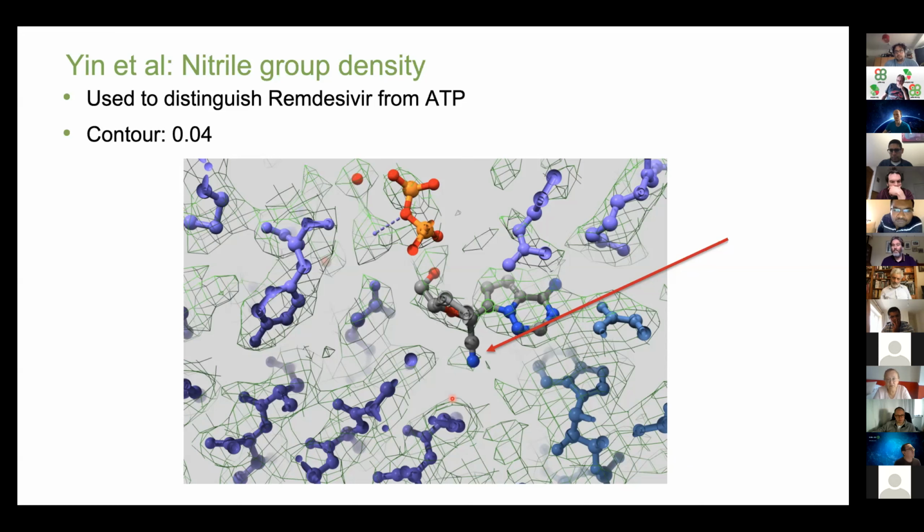It means we have problems with the orientation distribution of angles, and people do not realize the problem. Unfortunately, neither Fourier shell correlation nor local resolution indicates that it's a problem of an unlucky, unhappy distribution of angles.